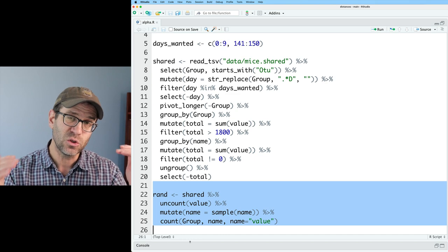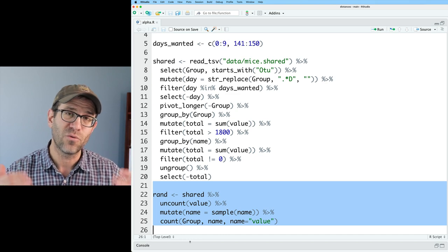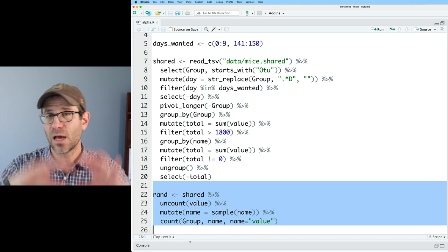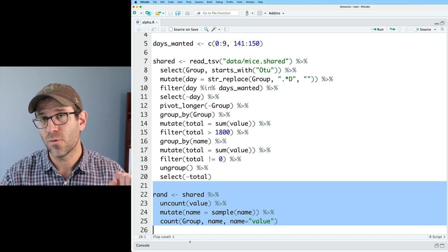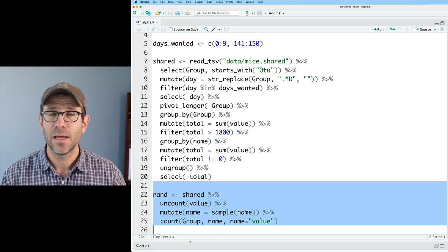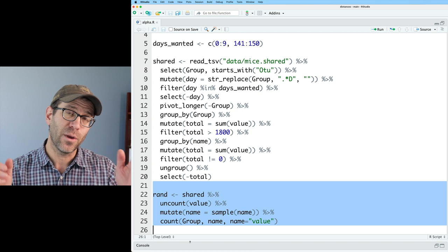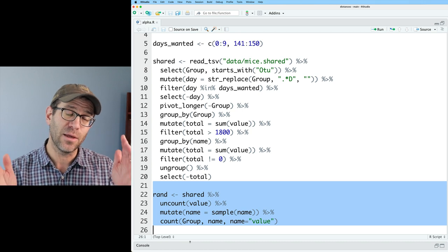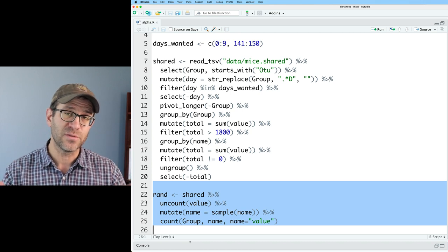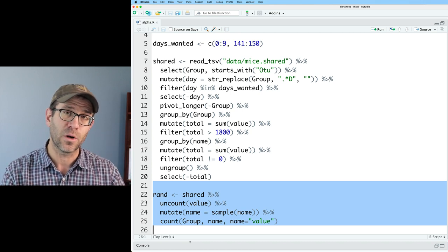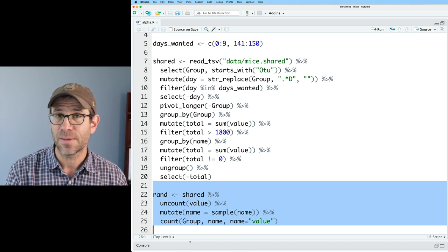Effectively, these are 225 random samplings of the same overall community, but where we are retaining the original number of sequences that were in each of the samples.